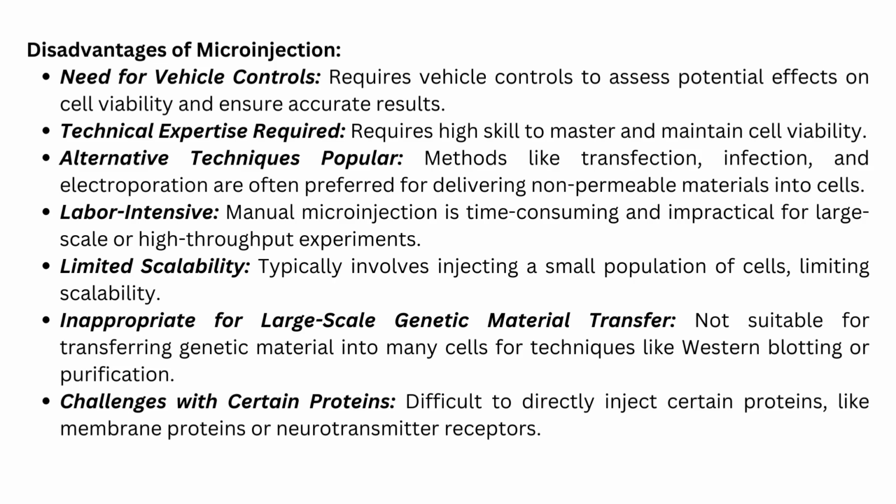Alternative techniques popular, methods like transfection, infection, and electroporation are often preferred for delivering non-permeable materials into cells. Labor-intensive, manual microinjection is time-consuming and impractical for large-scale or high-throughput experiments. Limited scalability, typically involves injecting a small population of cells, limiting scalability.